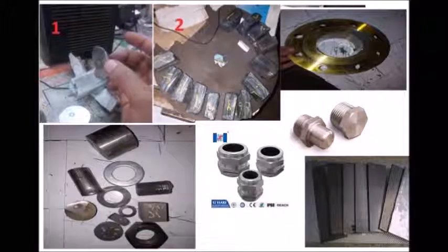I will illustrate these components in detail, but you should remember that our main issue is optical emission spectroscopy, OES, especially for analyzing steel alloys that our company produces. So let's begin with our samples, and how we get them excited. These are the common samples in our mill, and chemists should recognize them. There are also other samples with different shapes and concentrations.